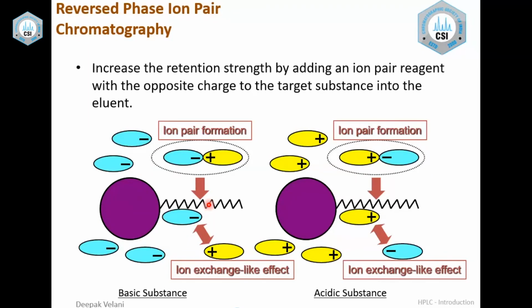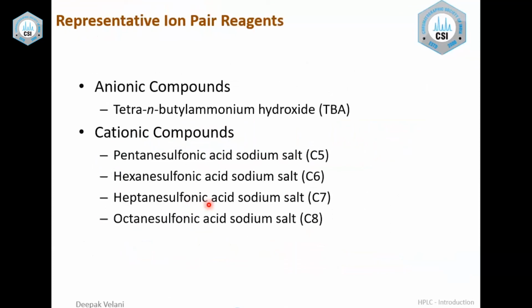But equilibration is very, very important in this particular case. Of course, it is important in other cases also. It is highly important over here. And equilibration of the ion pairing agent with the stationary phase is very important for the separation.